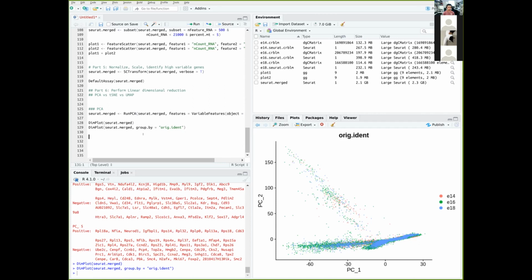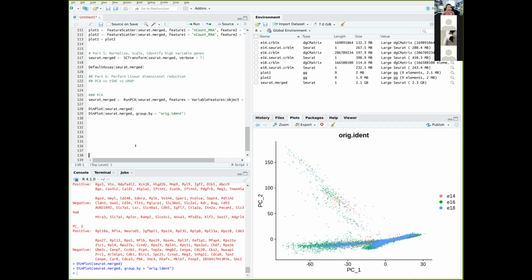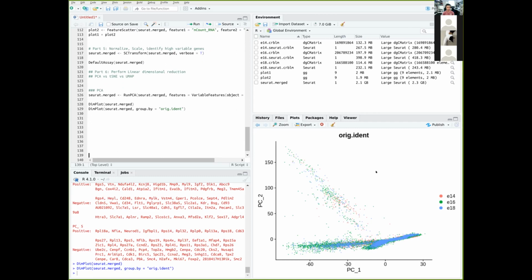There is this next part that I want you to try on your own. Make it two parts actually. I'll paste the code and the link in Etherpad, but they are optional parts.